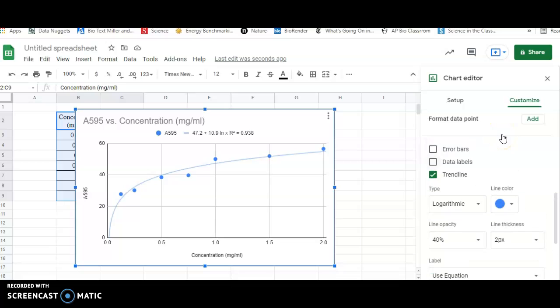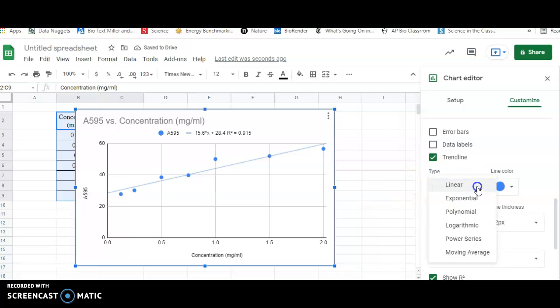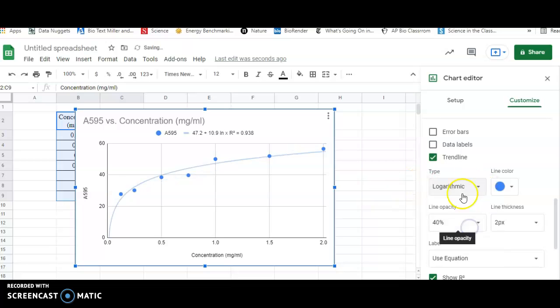If you don't want to go into all that for the purpose of the lab we're doing now, you can go ahead and use the linear curve. It's fine. But this linear one does give the potential for negative concentrations, when logically what we need this graph to give us is non-negative concentration values for lower absorption values. So whether you do logarithmic or linear, you're fine, the R squared value is still good. Hope this video helped.